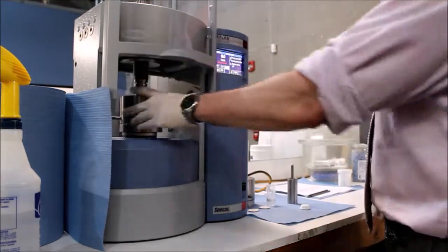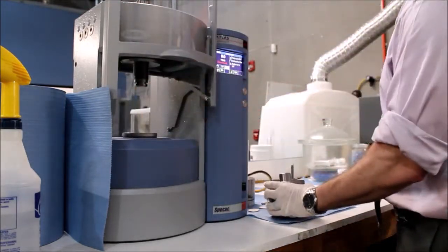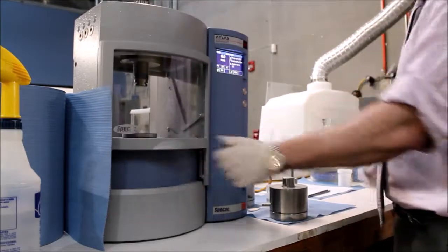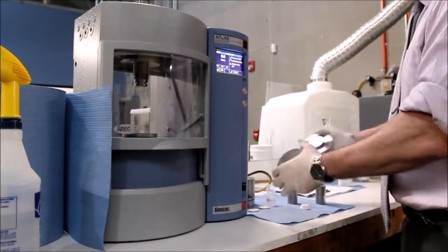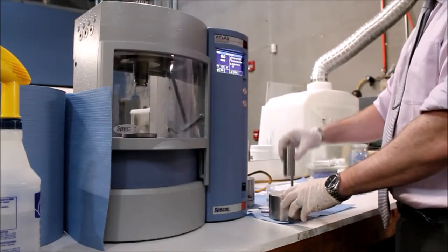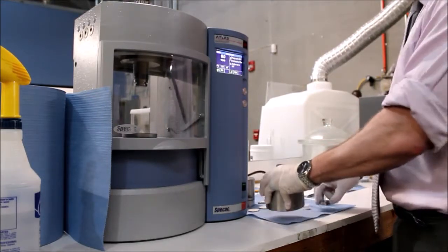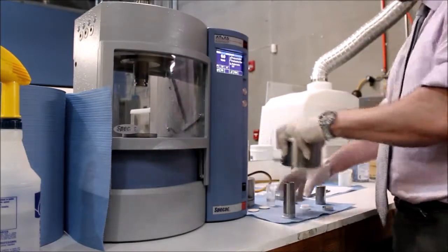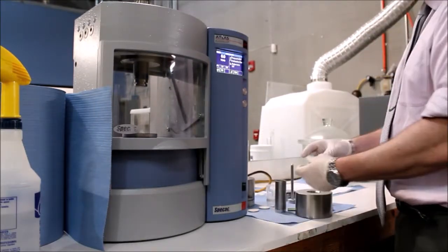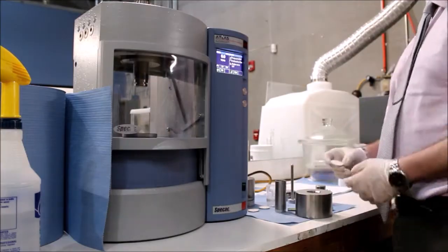From there, remove the die set and remove the plunger from the cylinder. This will then make removal of the base easier. Reinsert the plunger and apply a light load across to remove the pellet. A compacted pellet can now be mounted in the XRF analysis.